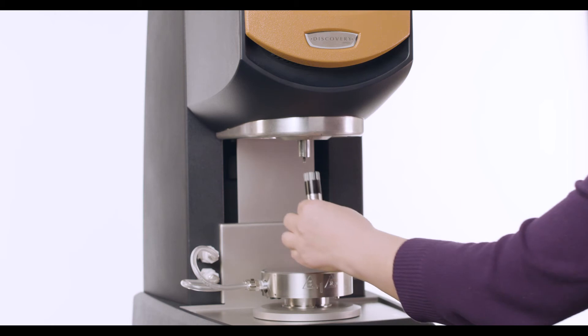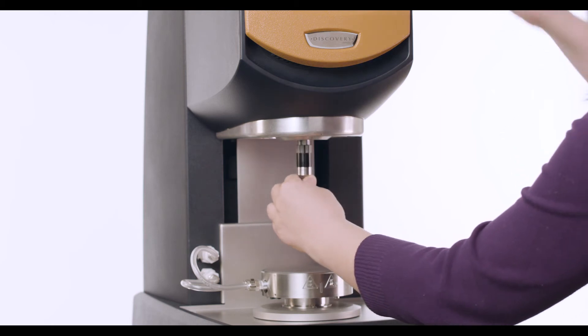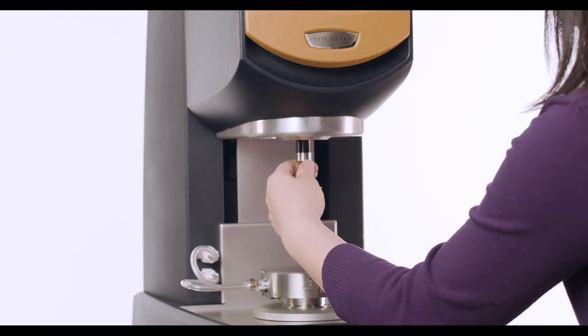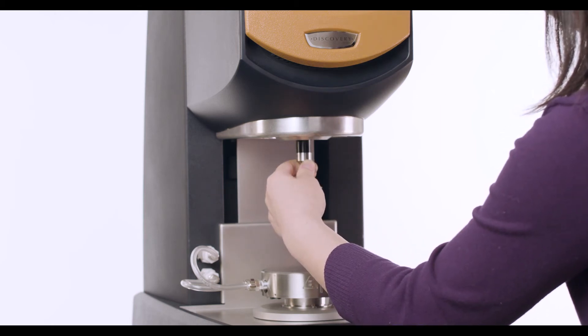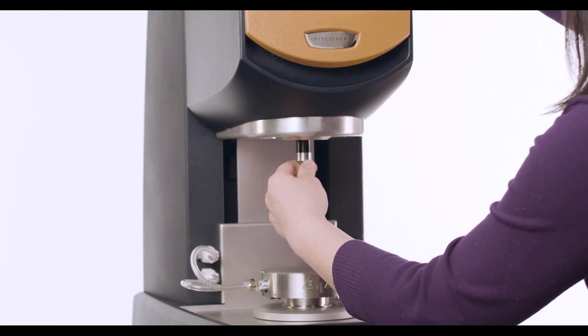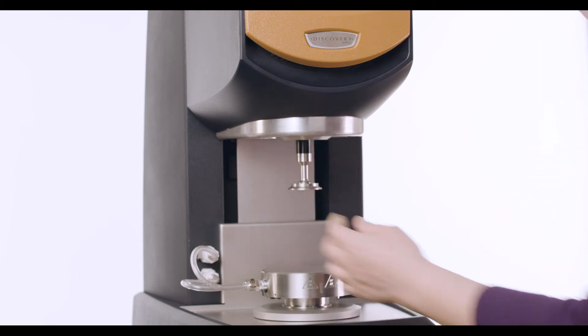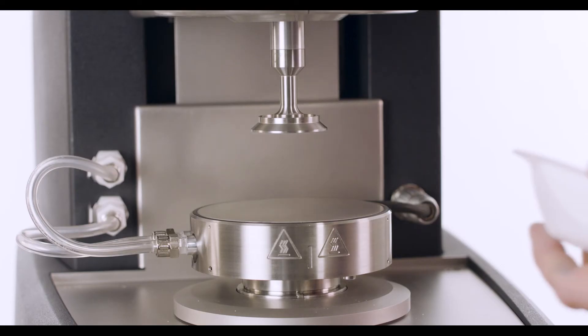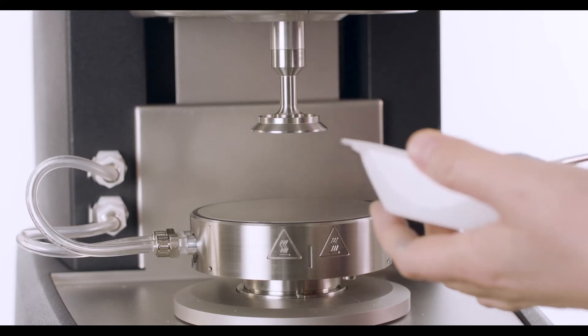Attach a 40 millimeter parallel plate geometry to the rheometer. Load your lotion sample.